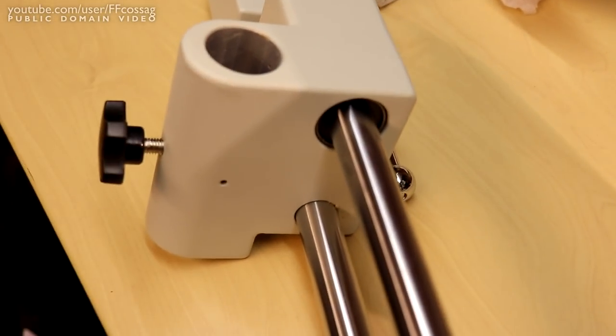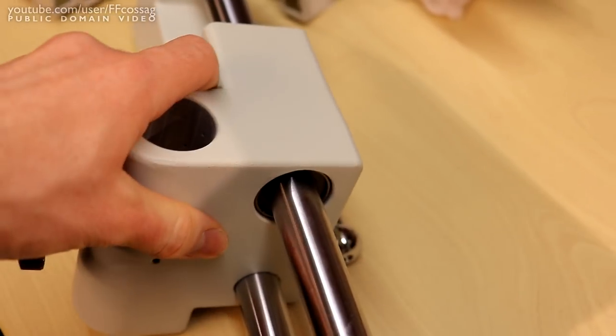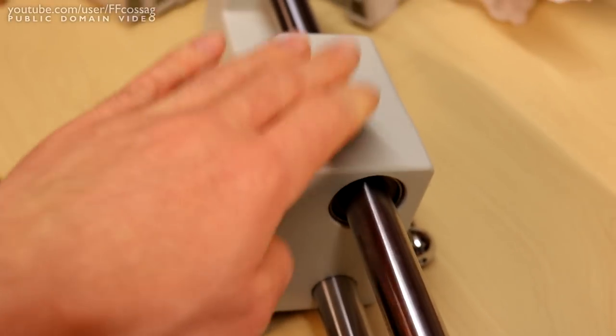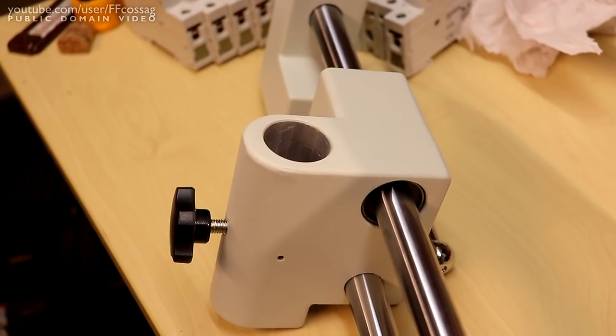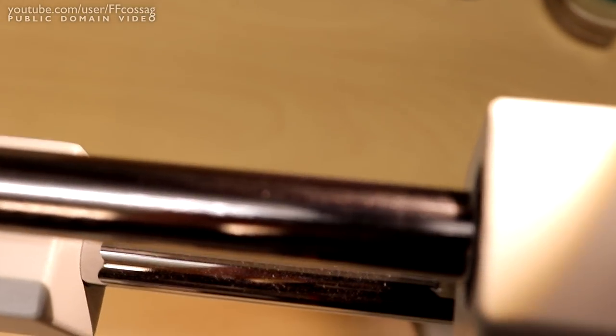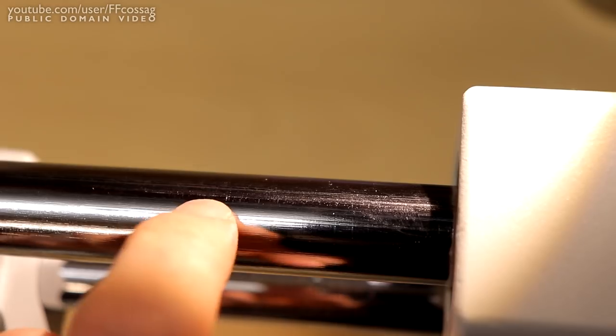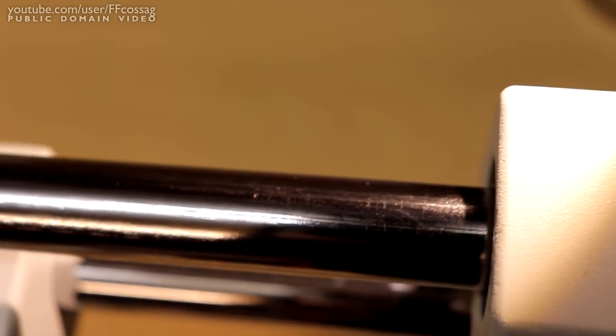The bearings on this one don't sound fantastic, there's some grinding noises coming from that. But the actual material on the arm might be better, and we're going to be able to tell that quite quickly because of how easily these chrome arms get tracks on them.